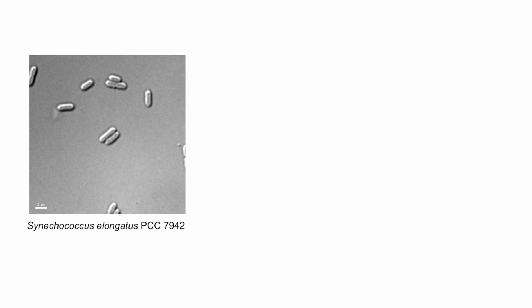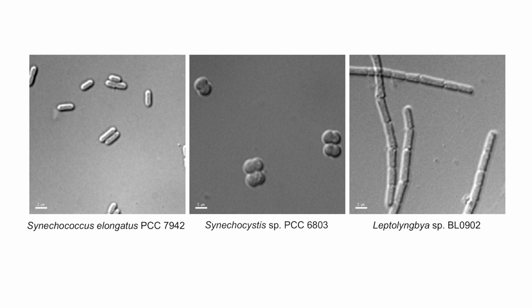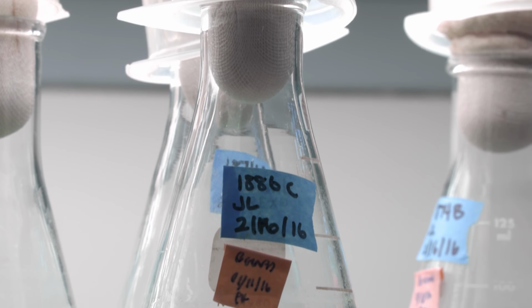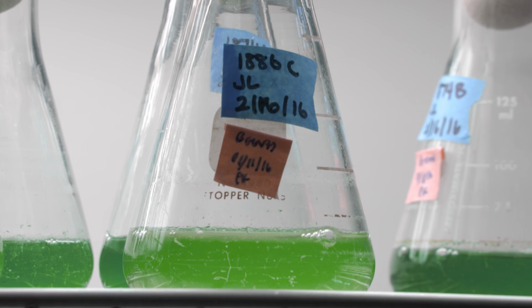This video is going to introduce you to the use of luciferase reporters in cyanobacteria in order to monitor their circadian rhythms. Cyanobacteria are a phylum of bacteria that obtain their energy via photosynthesis. Cyanobacteria are also special in that they display circadian rhythms of gene expression, with rhythmic expression of up to 80% of their genomes observed. A better understanding of the circadian mechanisms of these simple bacteria could lend great knowledge and insight into the evolutionary basis of circadian rhythms and the means by which cells can tell time.